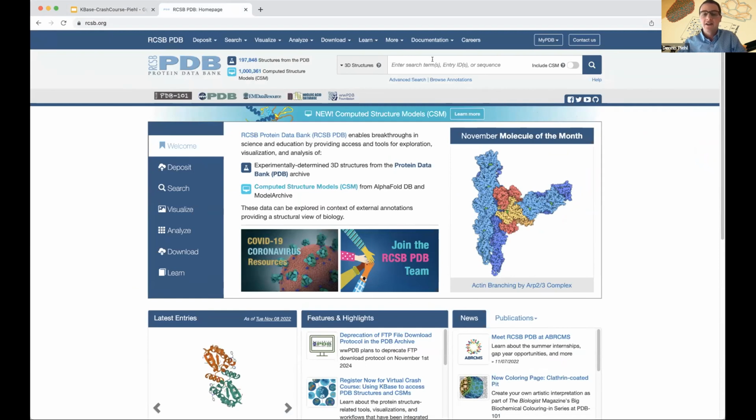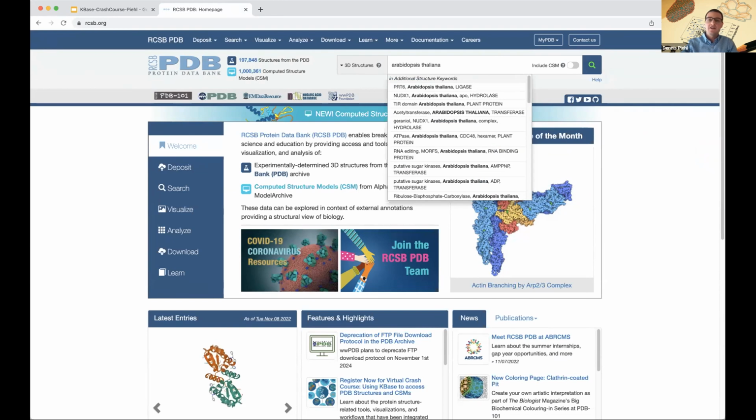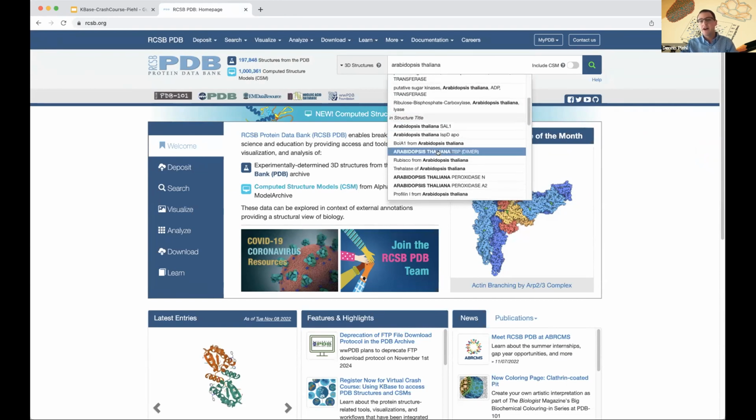And so when we land on rcsb.org, we are presented with the top bar search. Let's go ahead and just try to use that. So let's try to just search for Arabidopsis thaliana. And you'll notice that as I type, there are some suggestions that start populating in the drop down below.